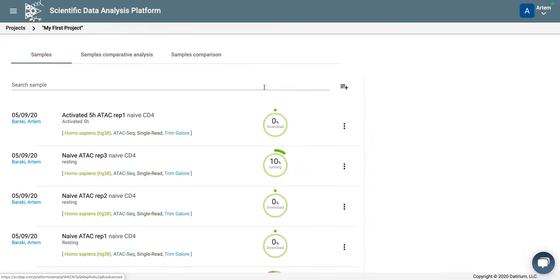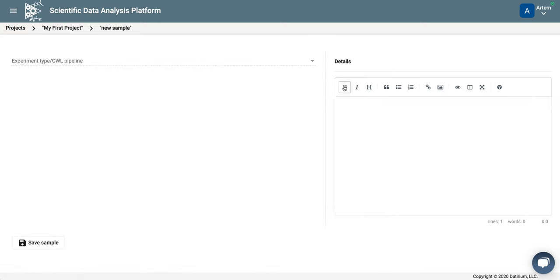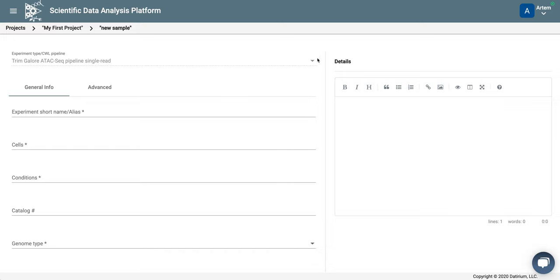Going to samples, and to add a new experiment, we just click the plus button. So here we select the pipeline that we want to use. This is trim-galore-ATAC-seq-pipeline.